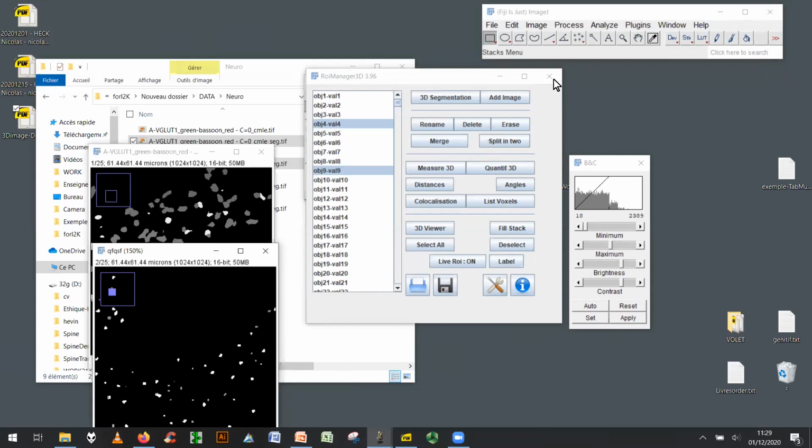We didn't talk about macro things, so yeah, just any. So Jonas? There is a question about segmentation from Agatha actually on the chat. Sorry, Jonas. We'll come back to you later.